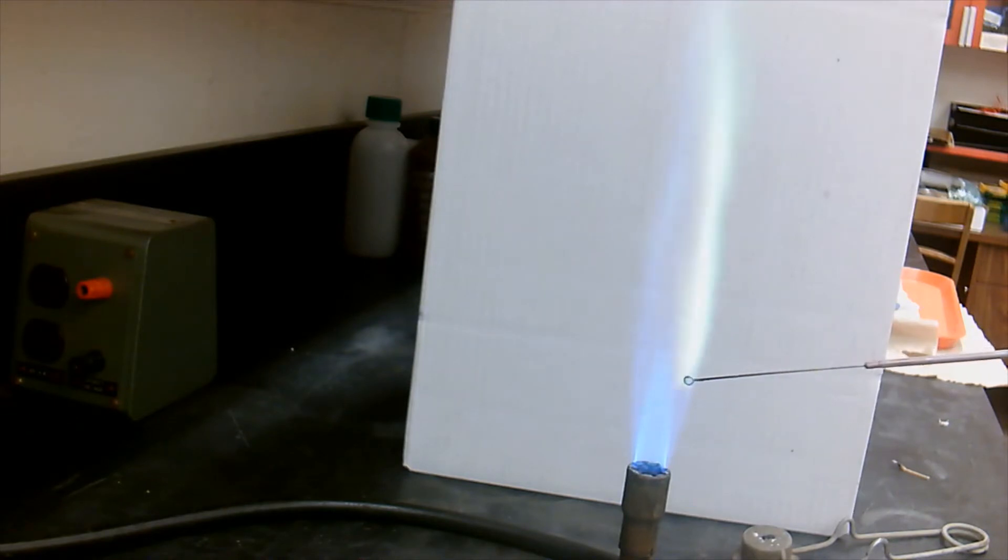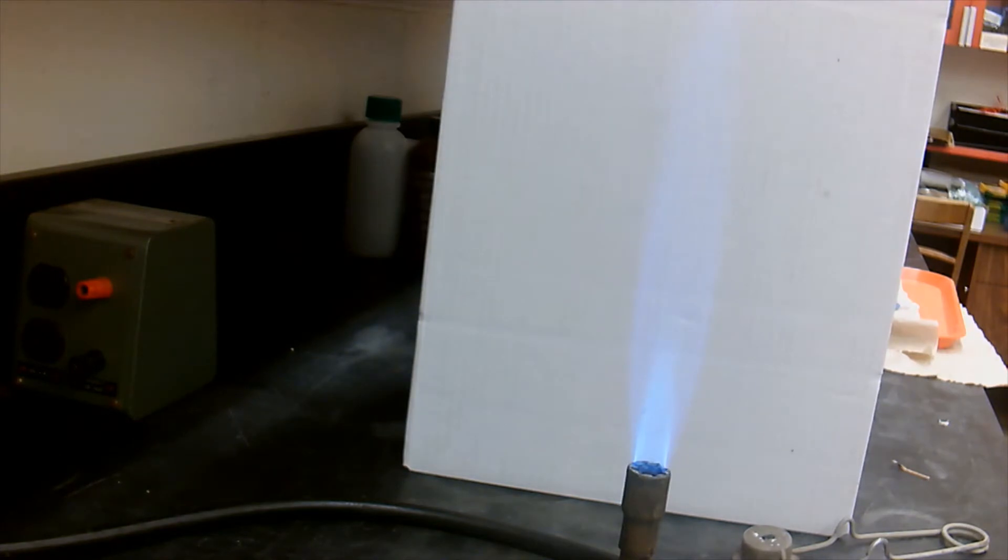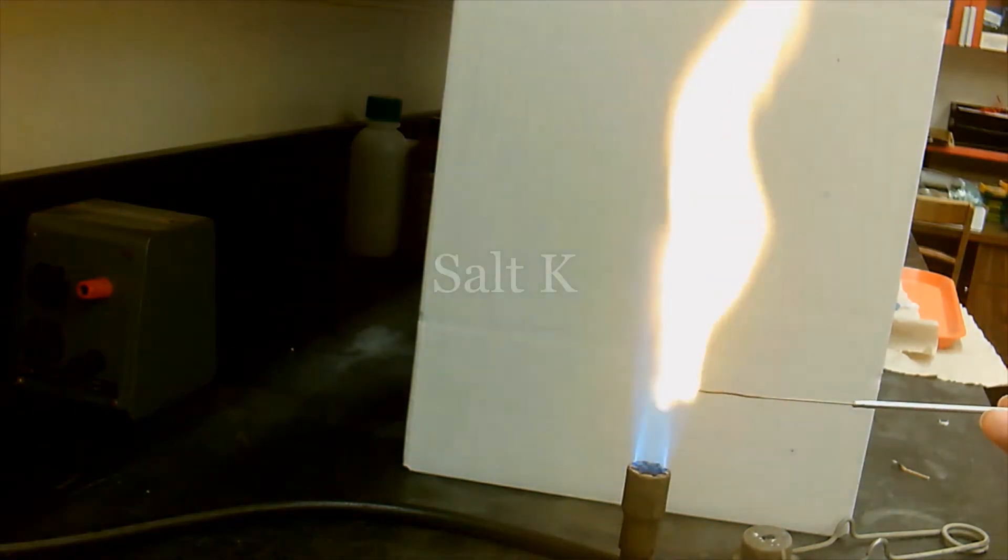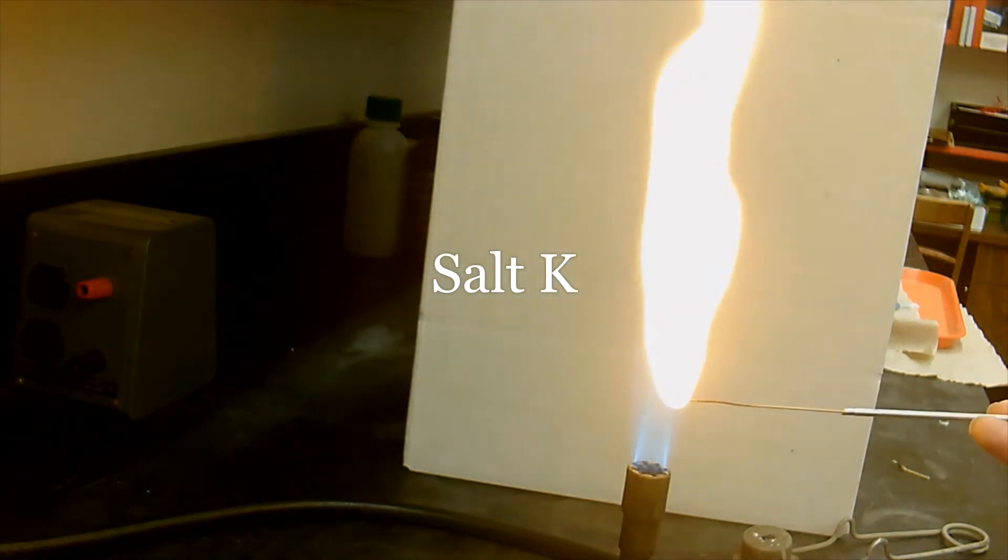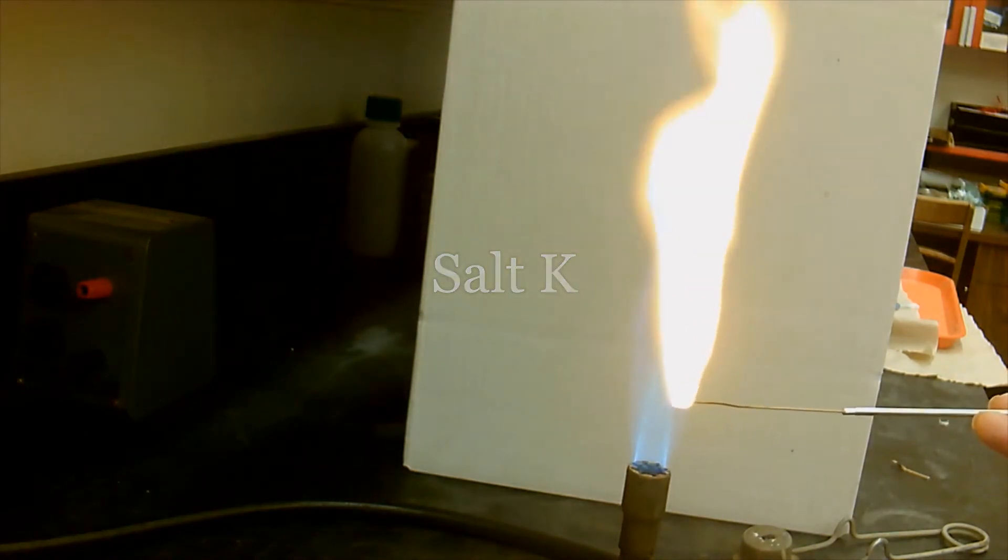So this is our salt J. It's our salt J, green. Let's go on with our salt K. This is our salt K. It's a bright orange.